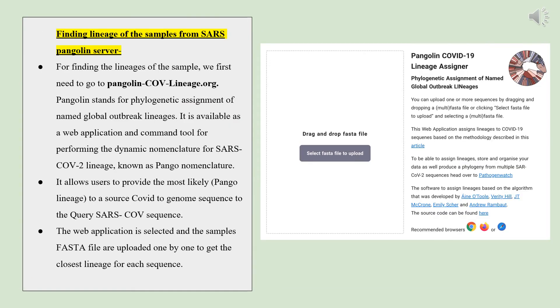The next step is to find the lineage of samples from the SARS pangolin server, for which pangolin-cov-lineage.org is used. It allows users to assign the most likely lineage to a SARS-CoV-2 genome sequence. The web application is selected and FASTA files are uploaded to get the closest lineage for each sequence.